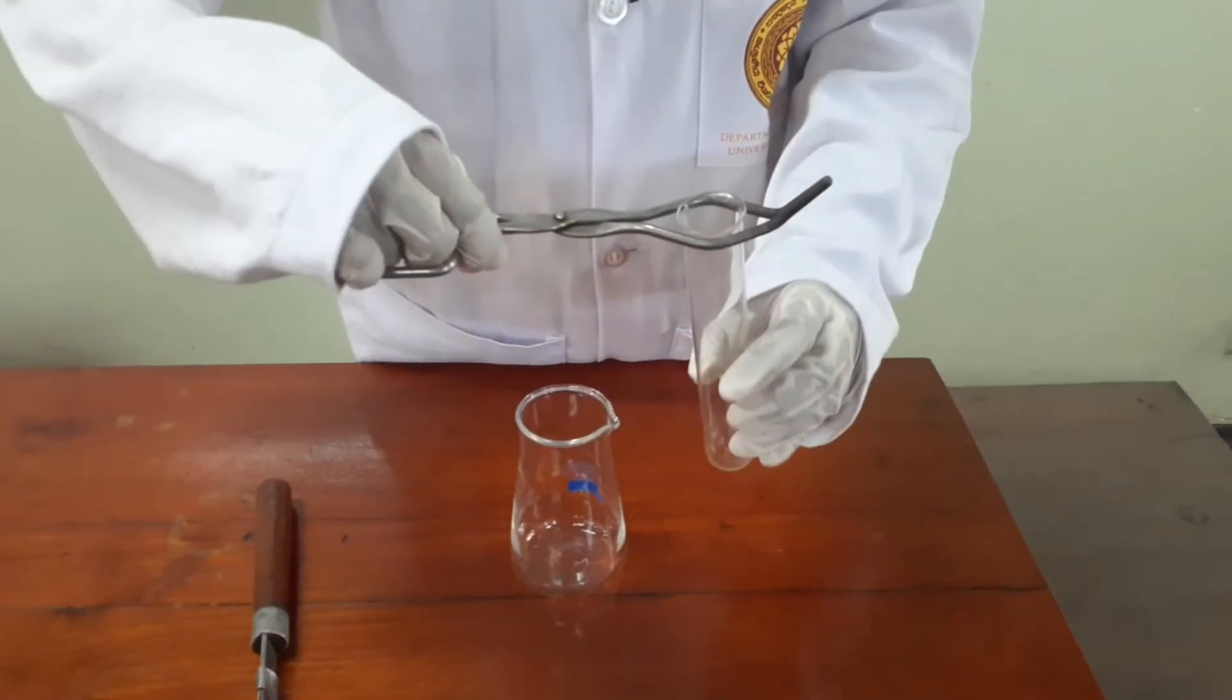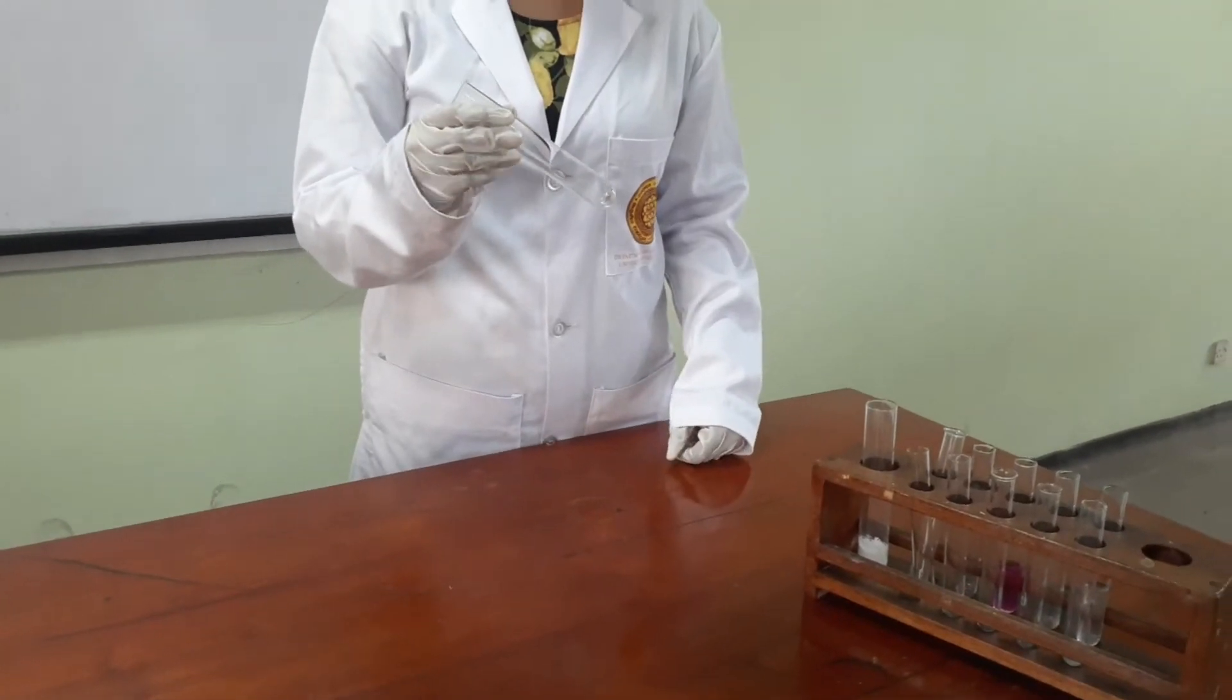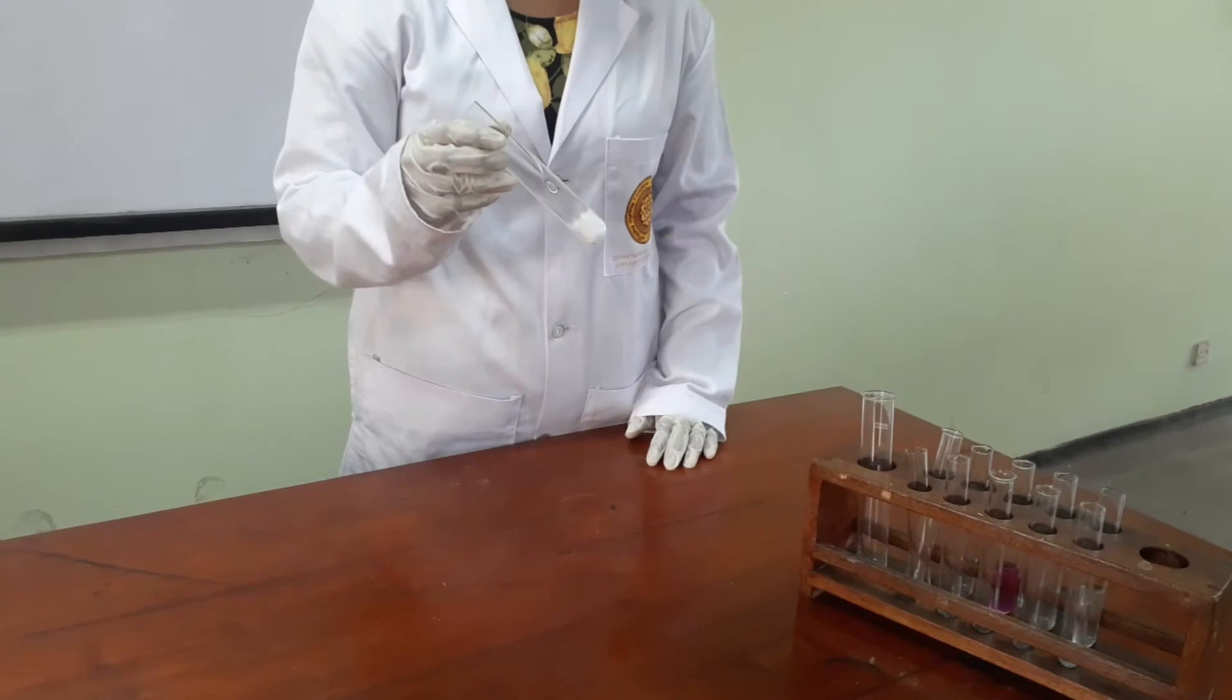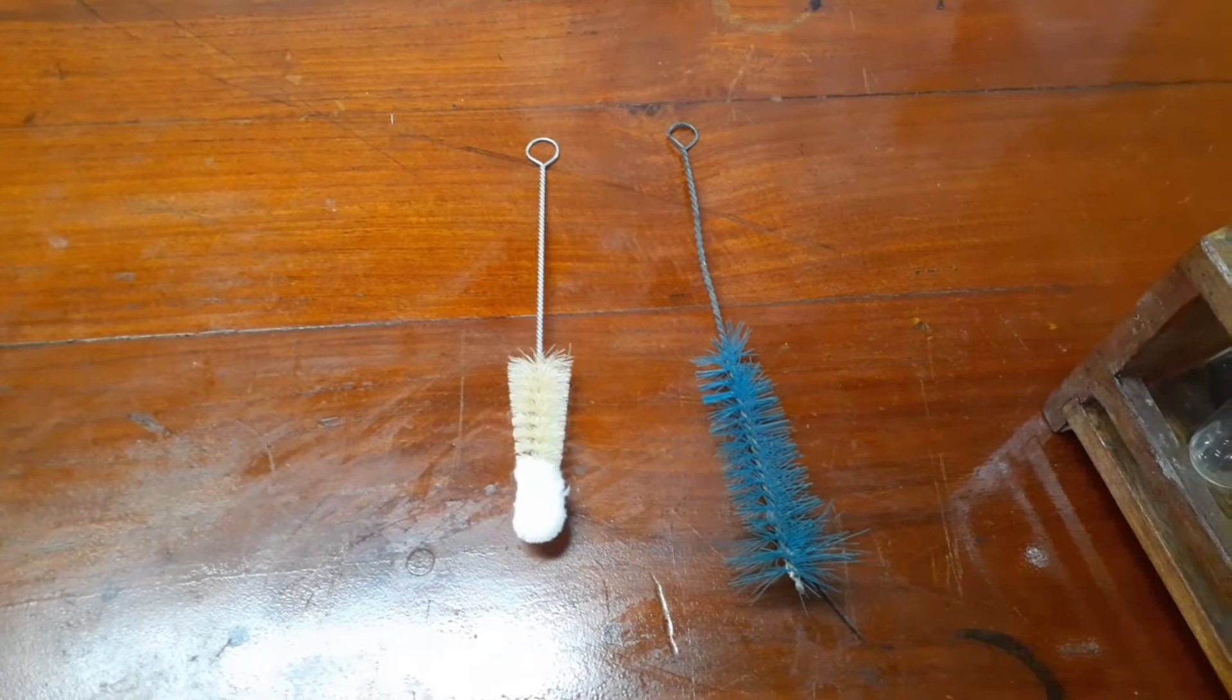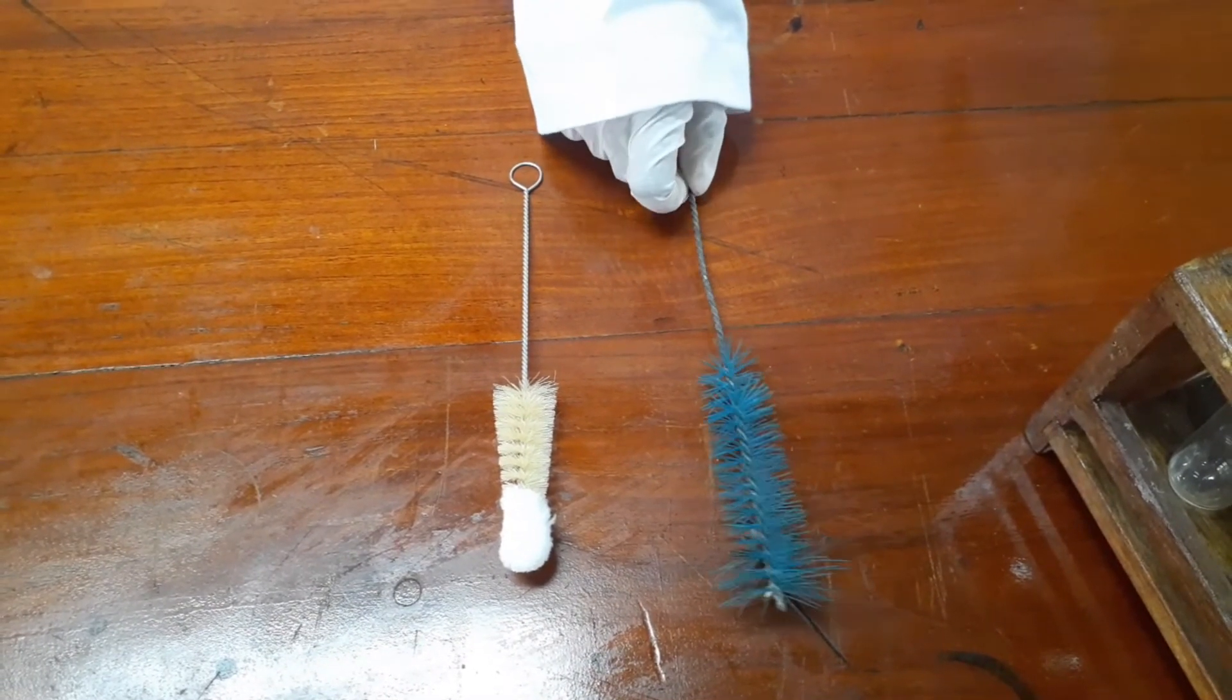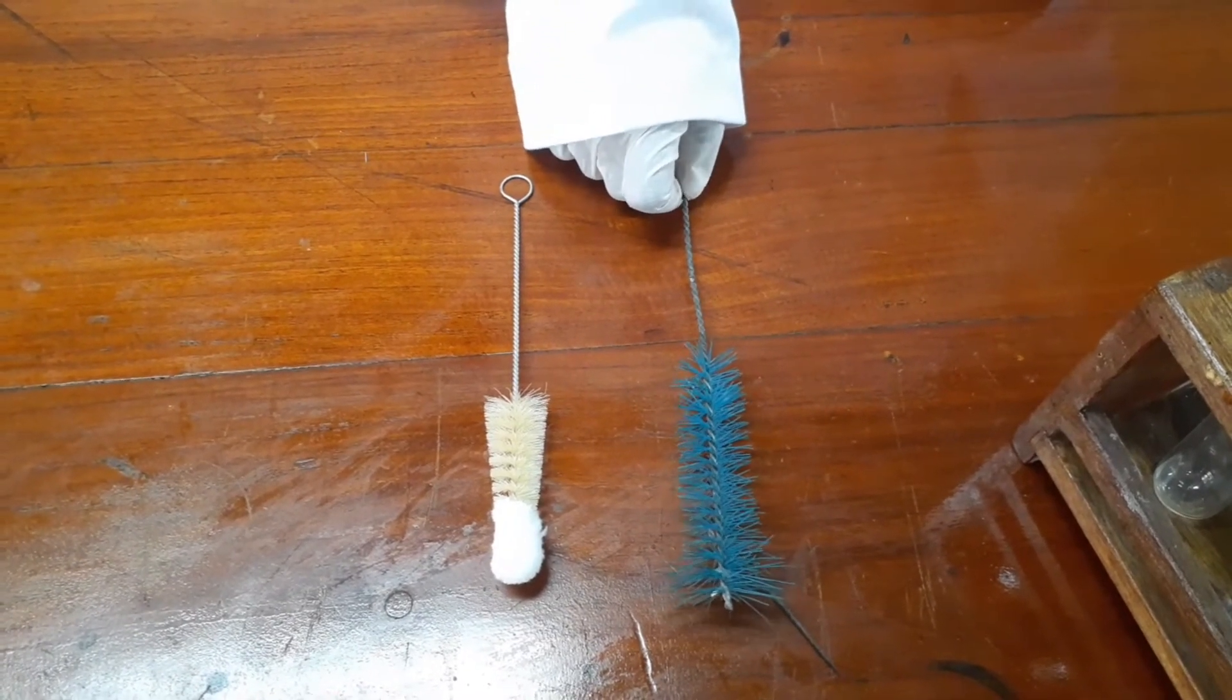We do not use tongs to hold boiling tubes as they can slip away from the tongs. If the test tubes and boiling tubes have any impurity, we have to wash them with clean water, and if they are insoluble in water, we have to wash them with dishwashing liquid. And those are the brushes that we use to clean glassware in the laboratory. If the glassware are contaminated with acid, we can use acid-resistant brushes instead of using these nylon brushes.